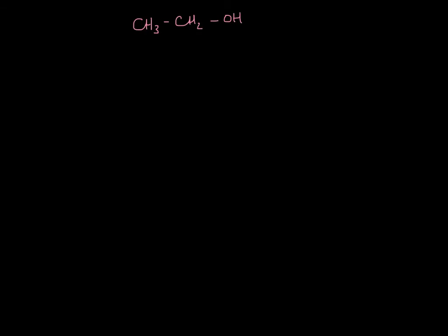CH3CH2OH. We said that the CH3s affected by nothing are going to show up between about 1 and 1.5, and indeed this guy shows up at 1.2 ppm. That's the CH3 that really has very little around it. A CH2, we said, shows up between 1 and 1.5, except that a CH next to an O is going to be significantly de-shielded. It's going to have its electrons pulled away by the oxygen. So CHs next to O show up between 3 and 4. This guy shows up at about 3.6 ppm.